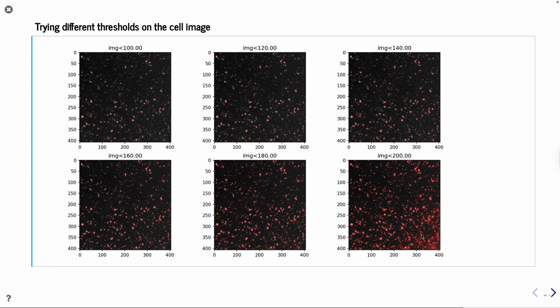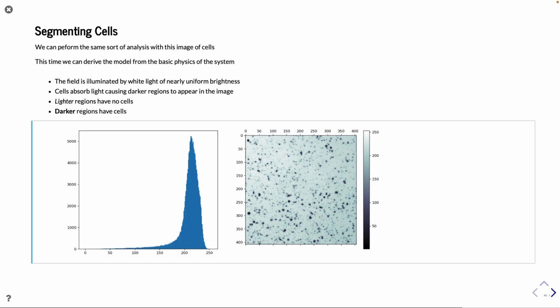And the reason for this diagonal is that maybe you can see that there is a gray level gradient in the image which goes diagonally. It's maybe not so easy to see in the daylight, but on your screen you can check this.